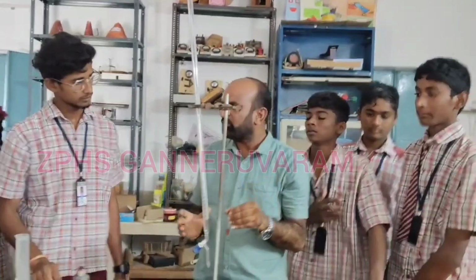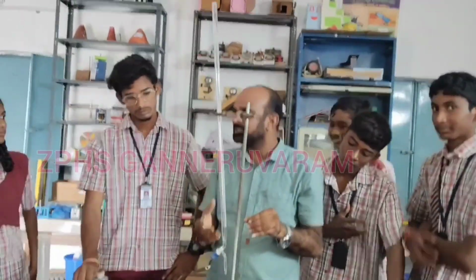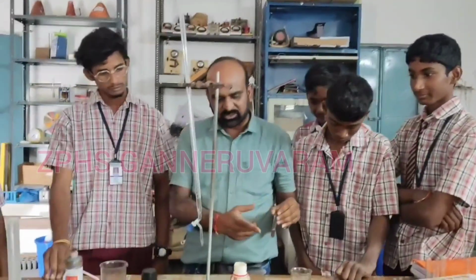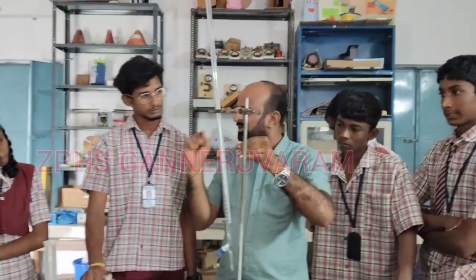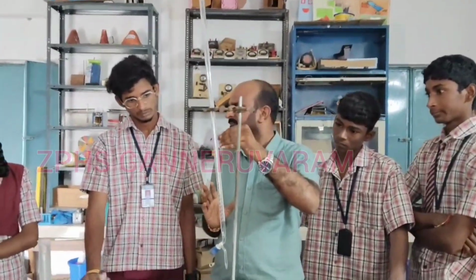Once the experiment failed, we have to find out why it failed, because the concentration of the sodium hydroxide is more. That's why we have to take a small quantity of any solution and do the experiment.